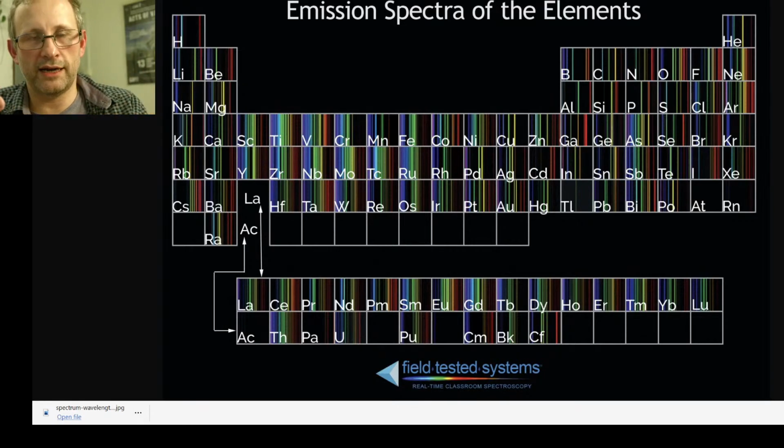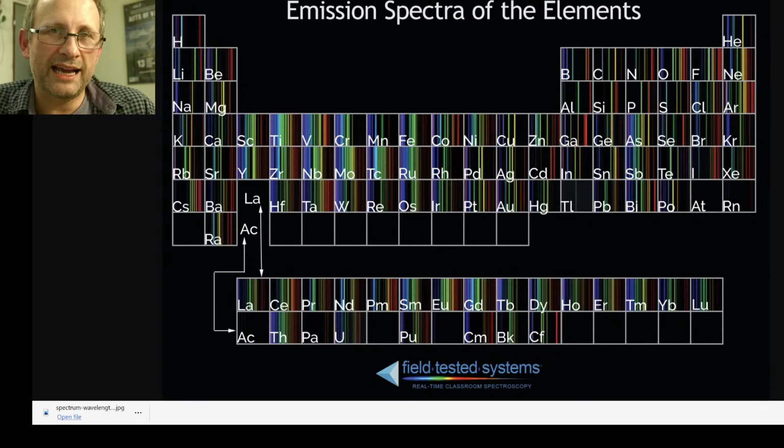And then further down the line, hopefully when I've had a little bit of experience with this and the data has been shared, we can use the same technique with the Vega reactors and maybe see more interesting elements being synthesized, because typically we're not necessarily starting with just carbon and air and a pencil lead.